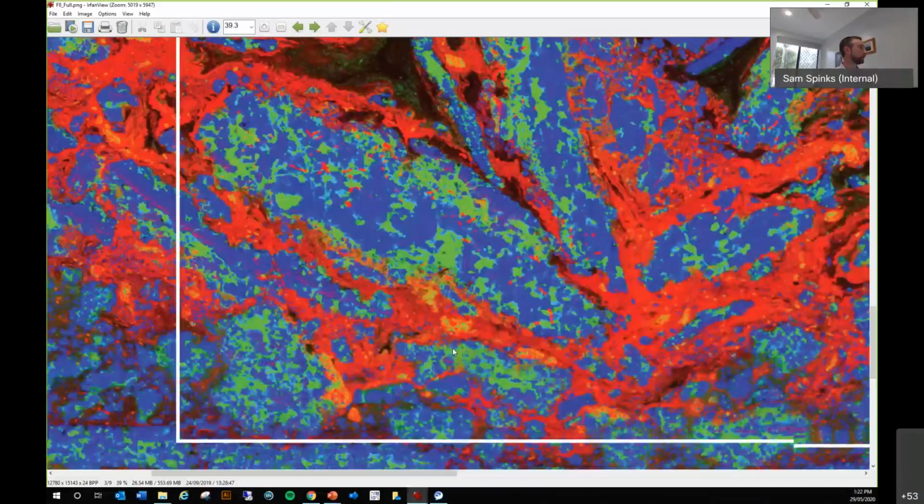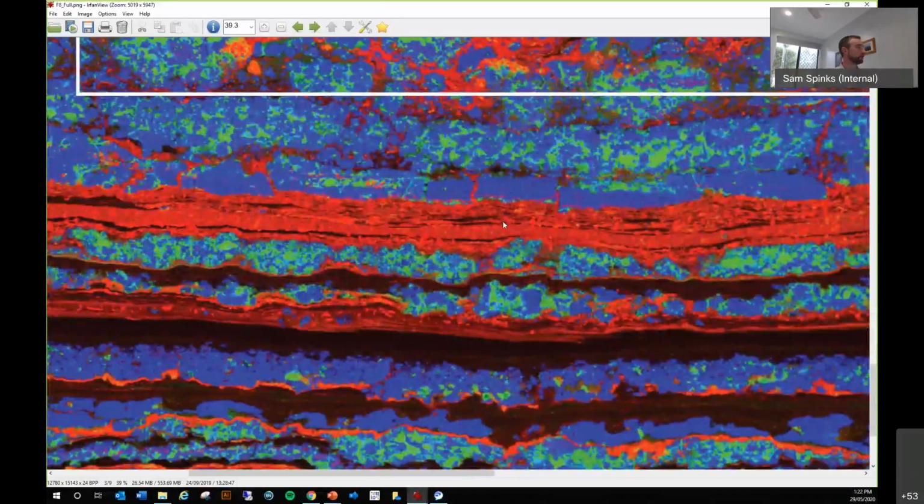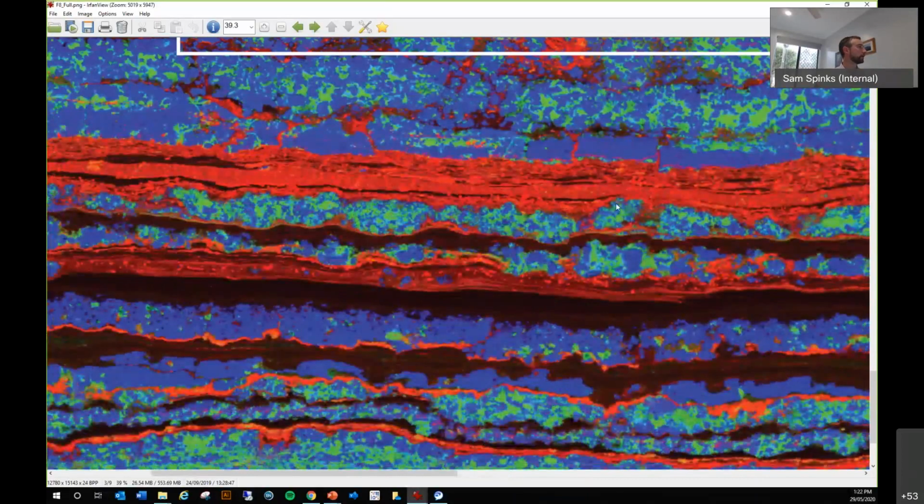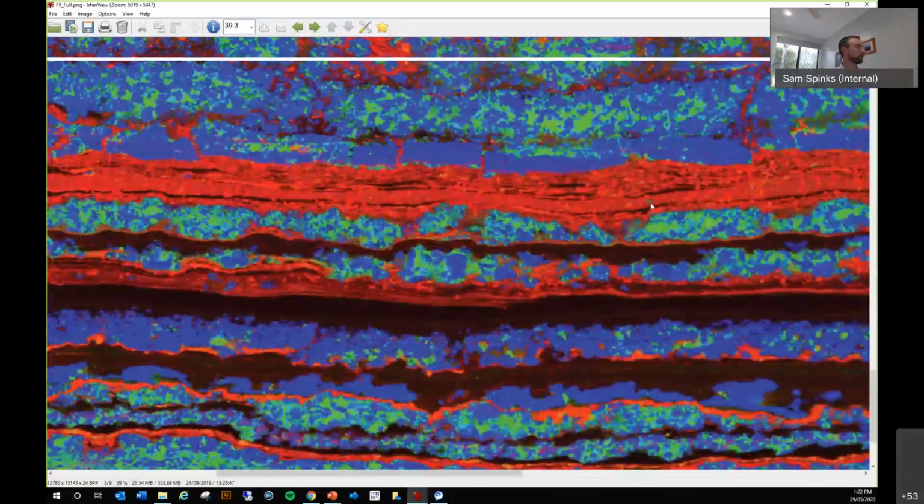If we look further down where the non-brecciated layers are, you can see there's absolutely no sphalerite through these zones at all. So this is in carbonaceous silt and interbedded pyrite carbonaceous silt, and you only get these tiny minor little blebs of sphalerite occurring. When we look at those in thin section on the micron scale, you can see that they too are surrounded by, and are actually replacing, the carbonate on a very, very small scale.